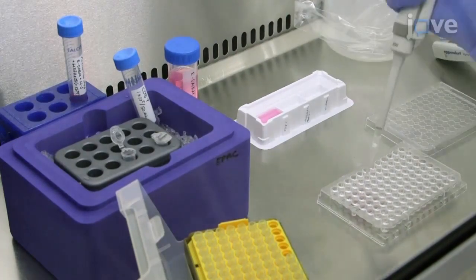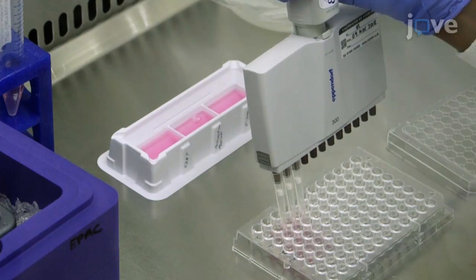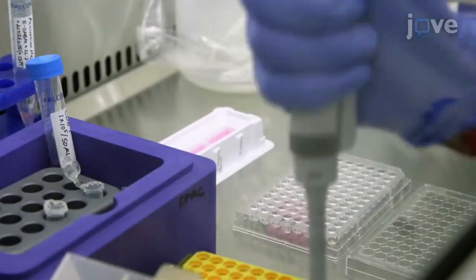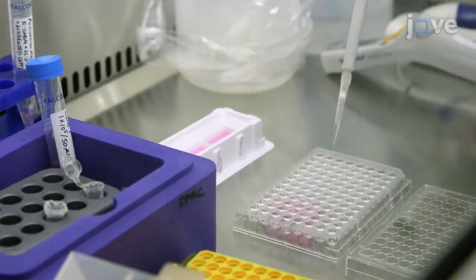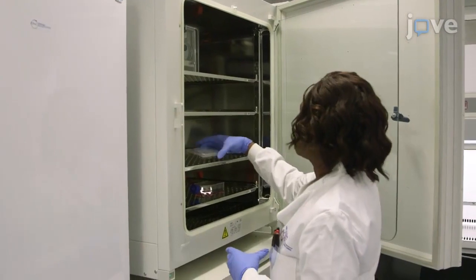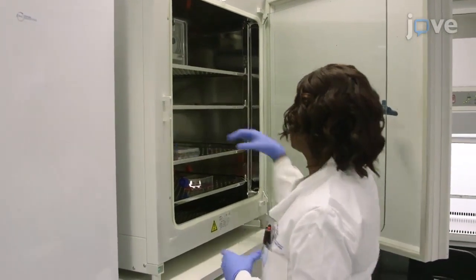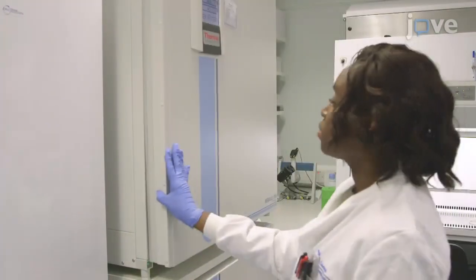well of T cells. Then add 50 microliters of freshly prepared activation medium and 50 microliters of eDMEM with or without the test reagents of interest to the appropriate wells, and place the plate in a 37 degrees Celsius and 5% carbon dioxide incubator with 95% humidity for 4 days.